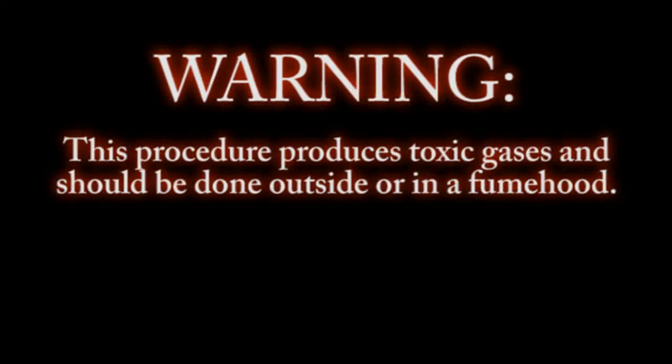Warning: this procedure produces toxic gases and should be done outside or in a fume hood.